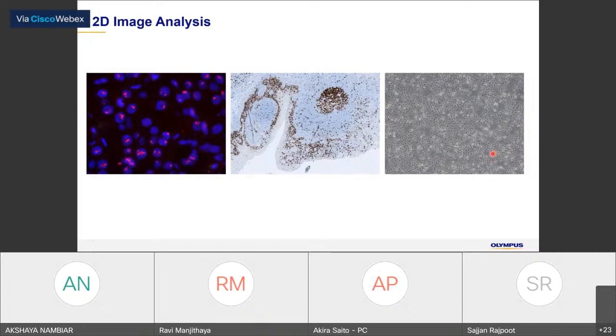That is the most important thing to think about before going to image analysis. After the image acquisition, it goes to the image analysis, including some kind of processing and also segmentation. But anyway, the imaging is actually the most important part to get the quantitative information from the biological sample.